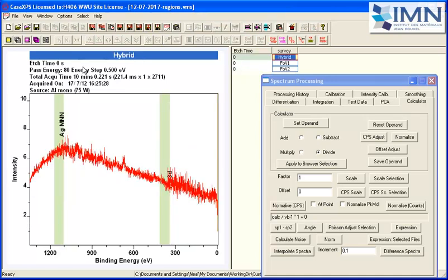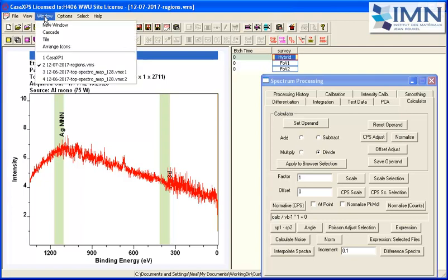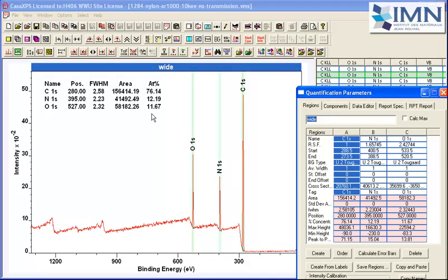So when these data were acquired on an Axis Nova from this nylon sample, we can say that we've got a nicely behaved transmission characteristic, which you don't necessarily get if you haven't set up an instrument for imaging. And the idea is using the imaging to set up the instrument so that you can get quantifiable spectra through the deflection analyzer.